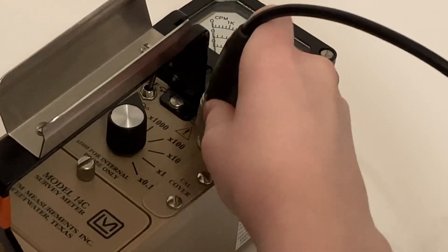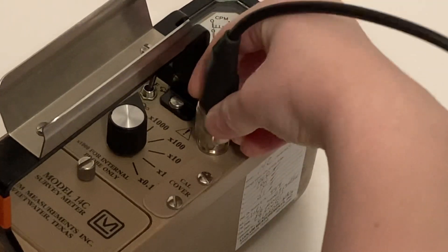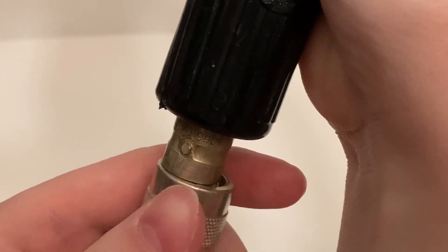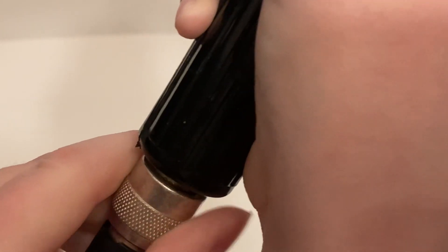Connect the Type-C cable to the connector on the Ludlum Model 14C. Connect the other end of the cable to the Model 44-9 General Purpose Alpha Beta Gamma Contamination Pancake Frisker.